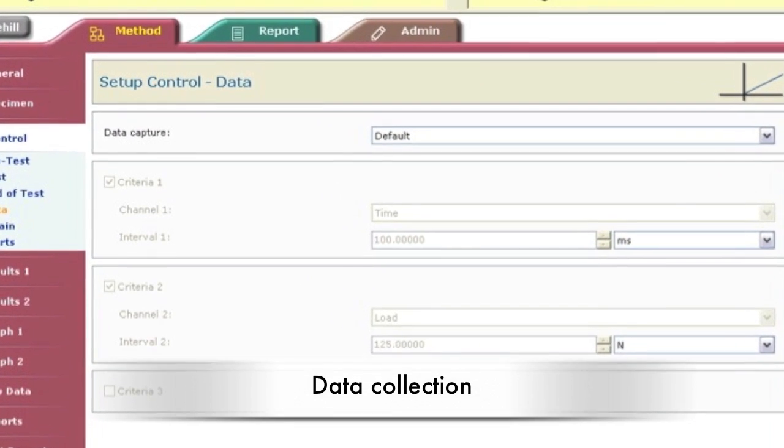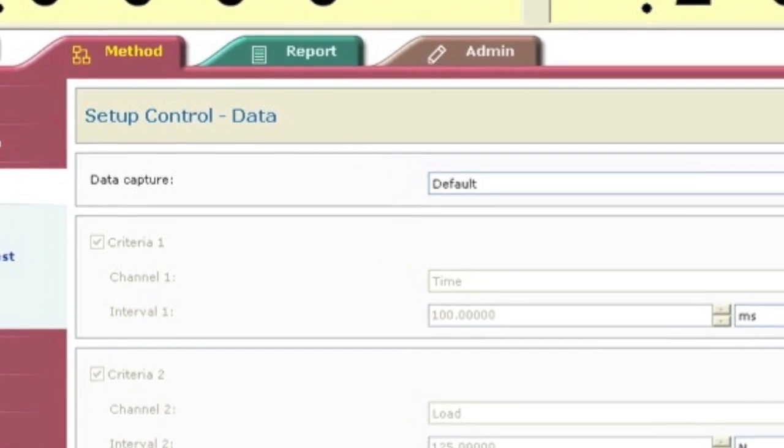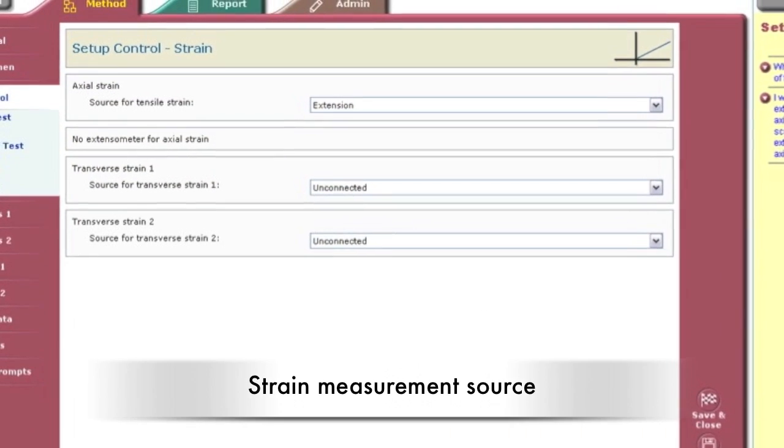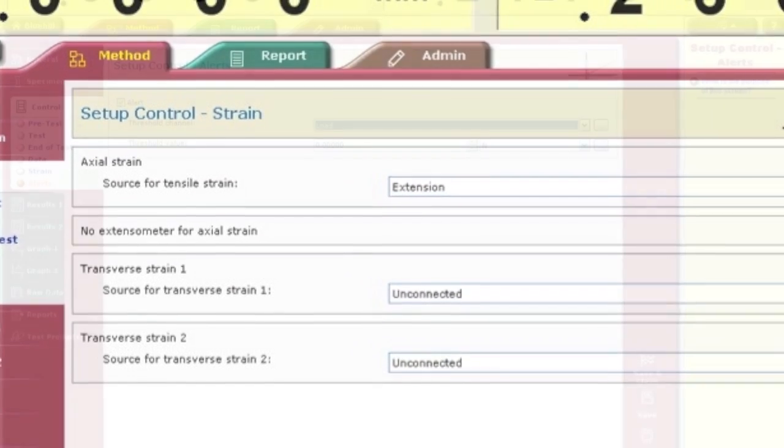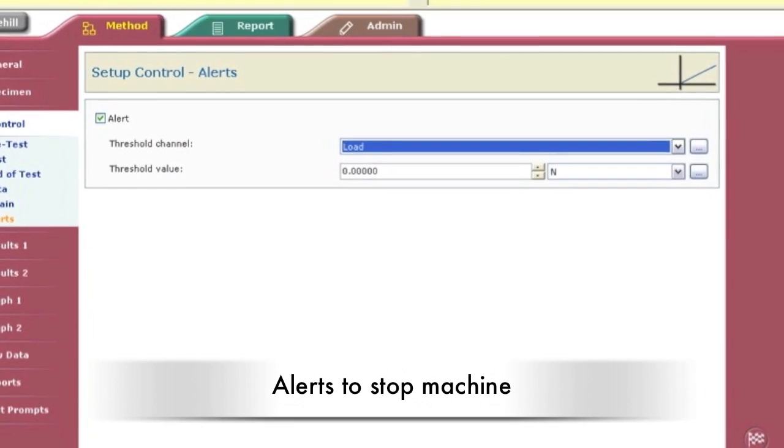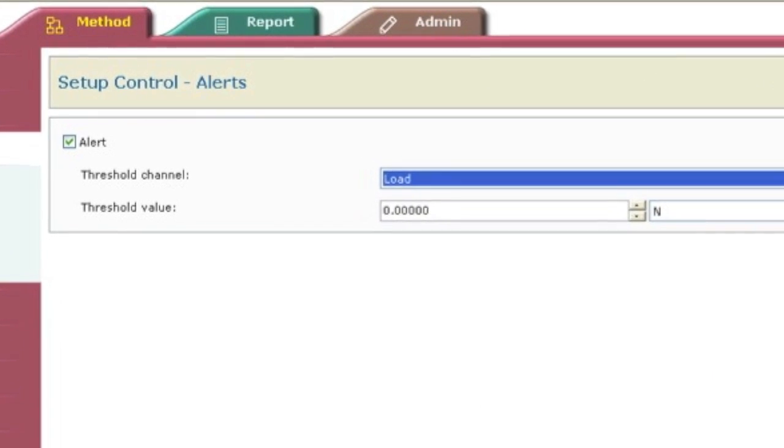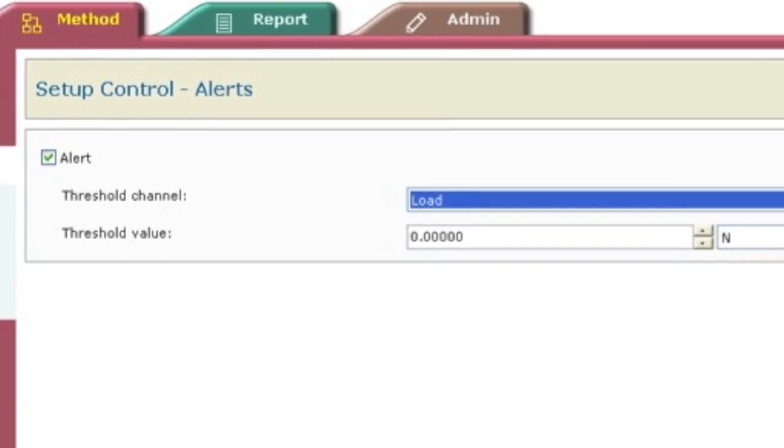The data tab specifies if the data is acquired manually or automatically, while the strain tab recognizes whether the strain is measured from the video extensometer or the extension. Alerts can be set up to stop the machine if certain criteria are reached, such as the maximum load that the load cell can withstand.